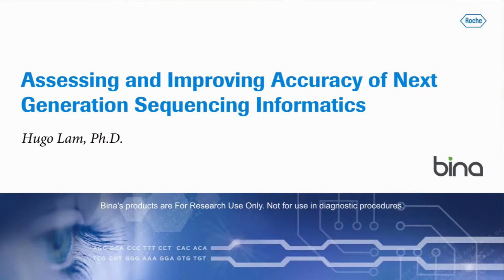Today I'm going to talk about how we assess and improve the accuracies of next generation sequencing informatics at Bina. About more than a year ago, we got acquired by Roche Sequencing, and now Bina is 100% owned by Roche Sequencing.